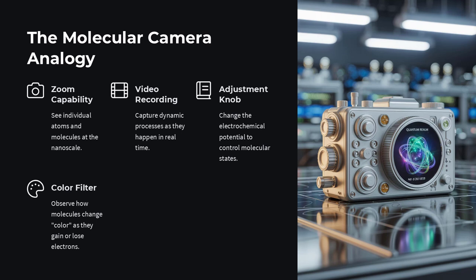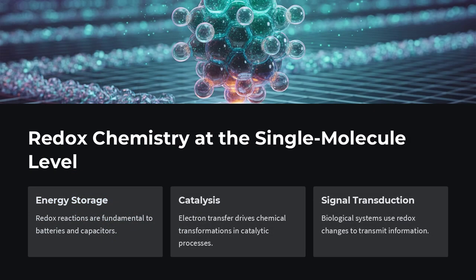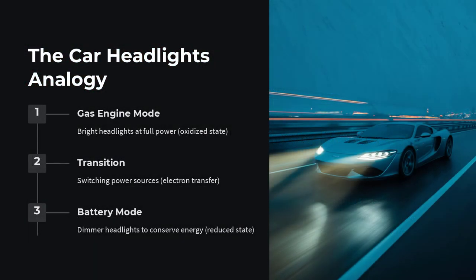Yes. One frontier is molecular scale batteries. Researchers are investigating redox-active molecules that can reversibly store energy. ECSTM helps identify how these molecules degrade over many charge/discharge cycles, leading to better design for long-term stability. In biophysics, ECSTM has been used to probe DNA and protein molecules, observing how they fold, unfold, or bind ions and drugs. For instance, single electron transfer events in cytochrome proteins can be tracked as they mimic electron transport in mitochondria.